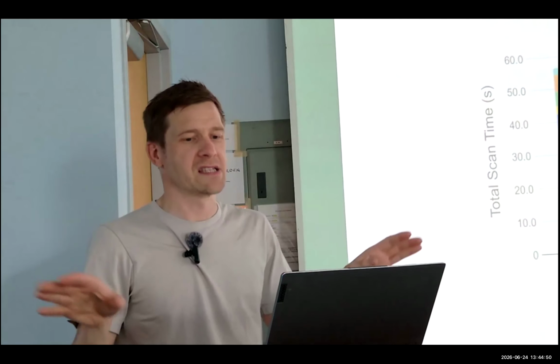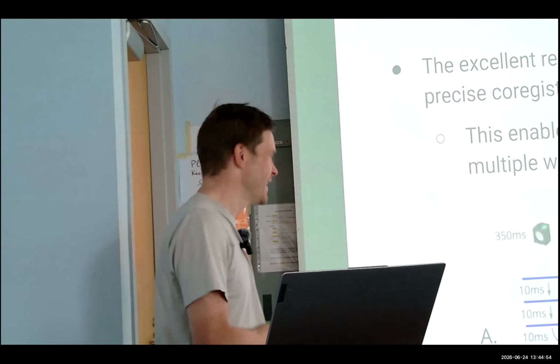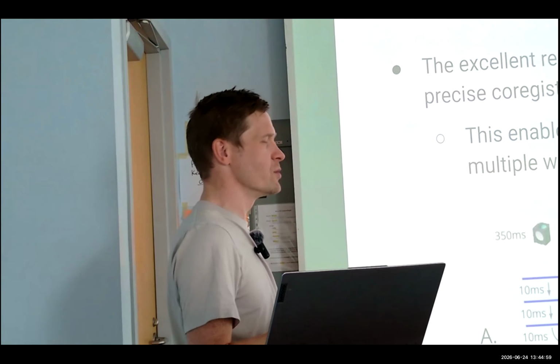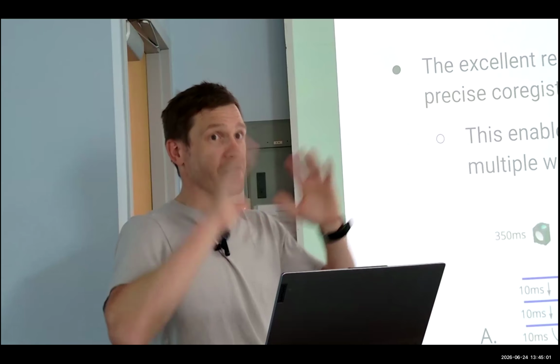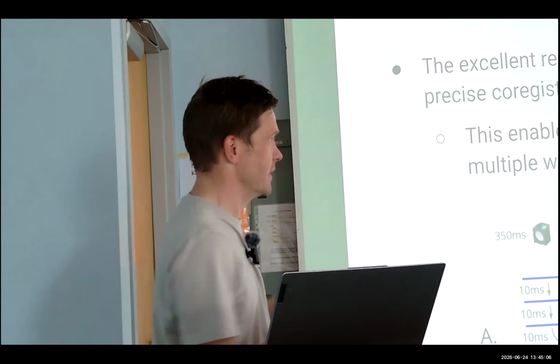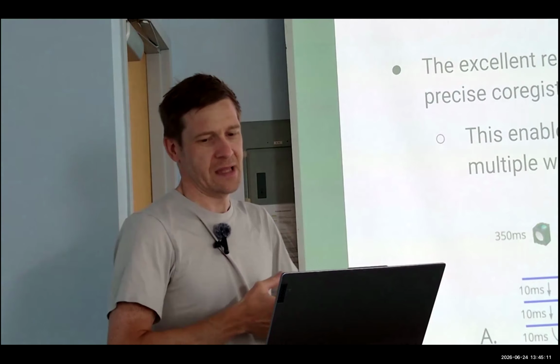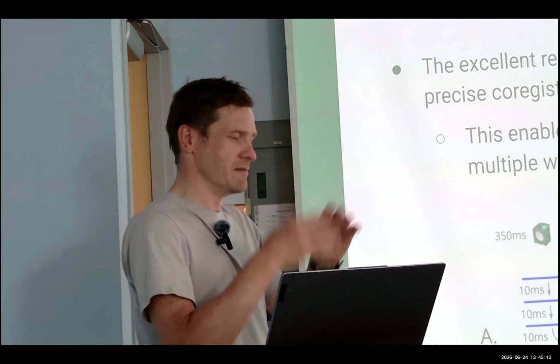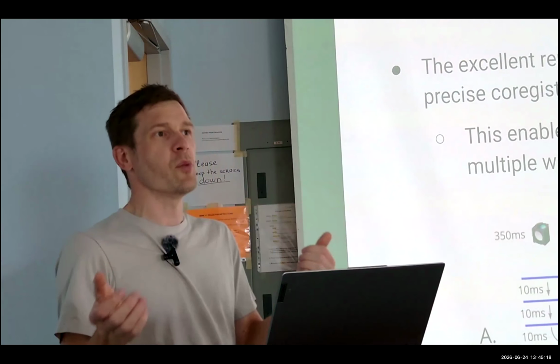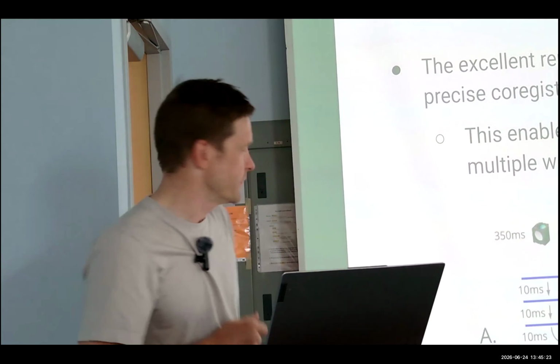So if you want to go fast, don't use Micromanager. But it's free, so people use it. There are way better tools out there, and Zaber makes a free alternative as well, which is way better and way faster, and built into our software. Micromanager is definitely out there in the community. There are some things it does really well, but if you're pushing throughput, it's not the right tool.